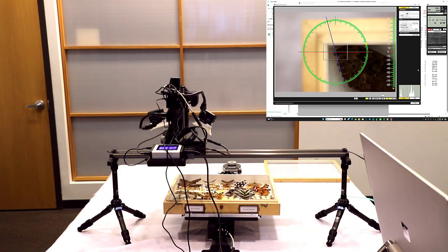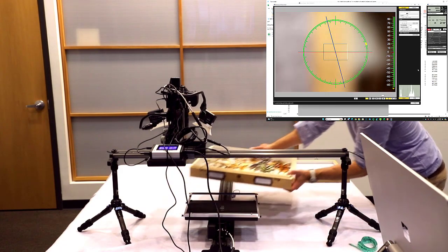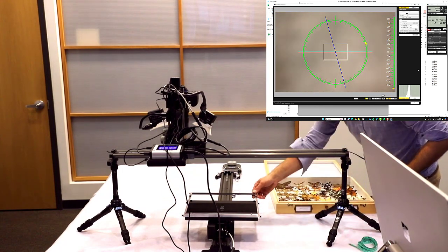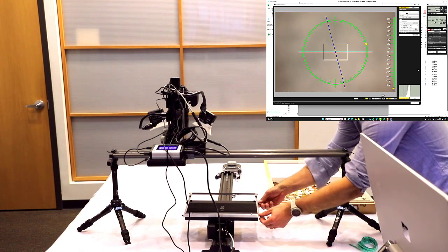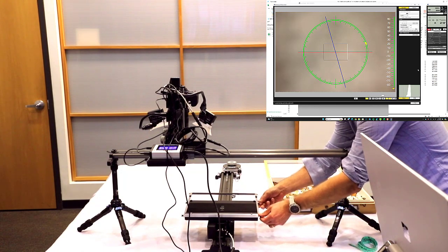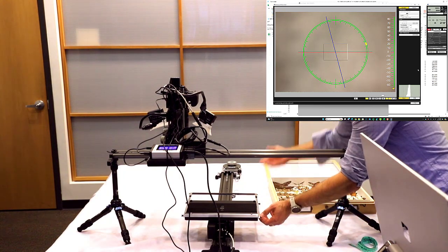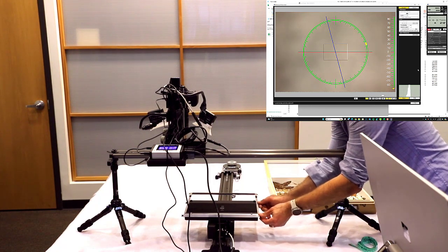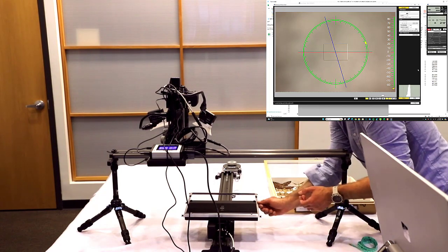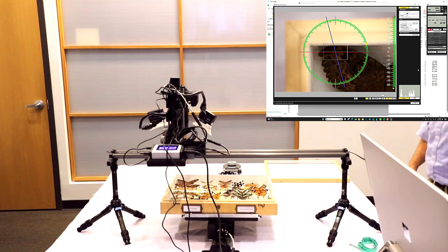The other thing I just want to point out as we're setting everything up is that the carriage that mounts the trays, if you have a big tray like this one, is designed to slide out. If you needed more clearance, you can unthread the screws here and extend this out a bit to make it larger, or you can close it off. But right now it does seem pretty good, so we're going to leave it. Just making sure that it's nice and snug, which it is.